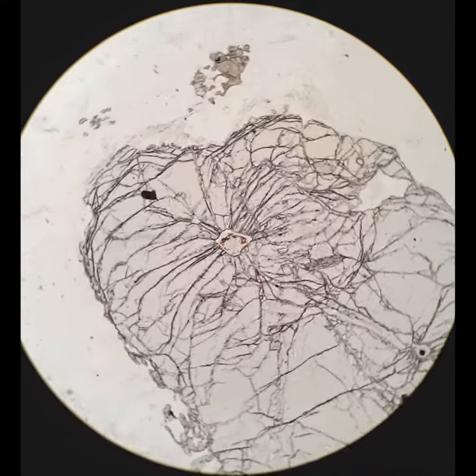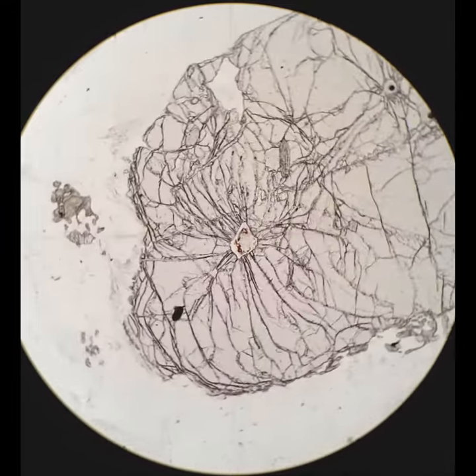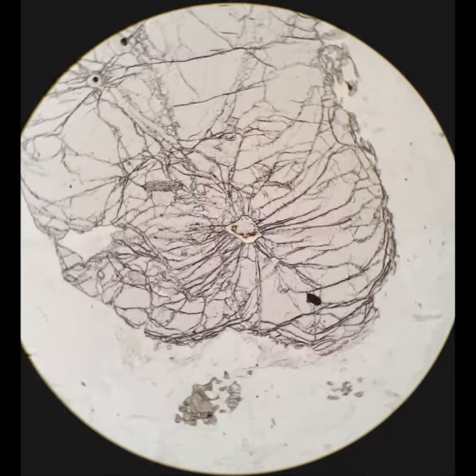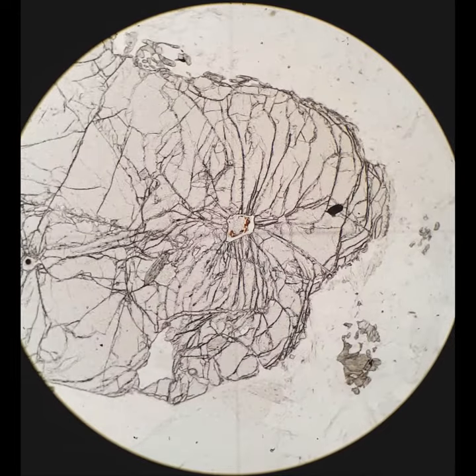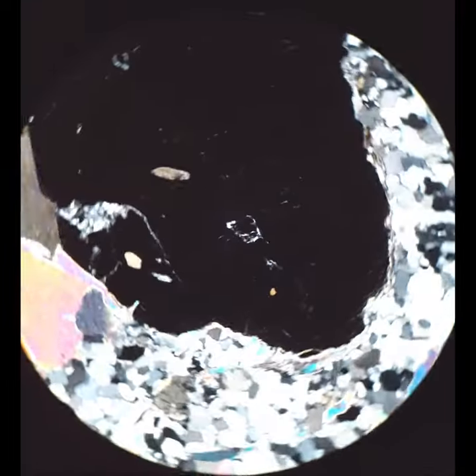When the coesite inverts to quartz, it expands and the pressure fractures the porphyroblast around it. So that garnet, which is all black, is heavily fractured around that central region.